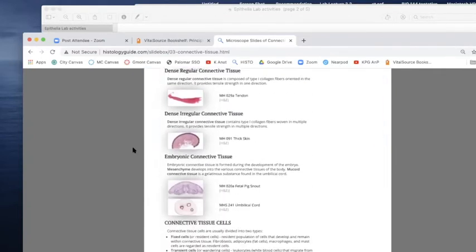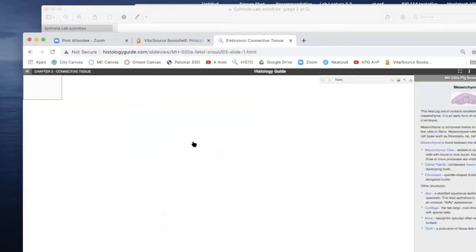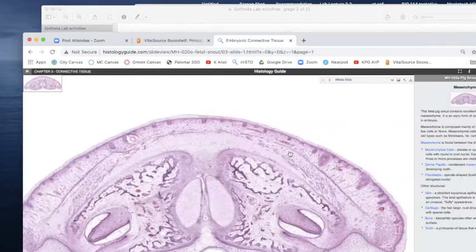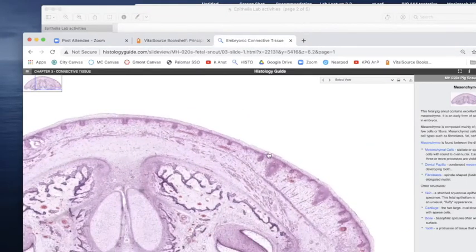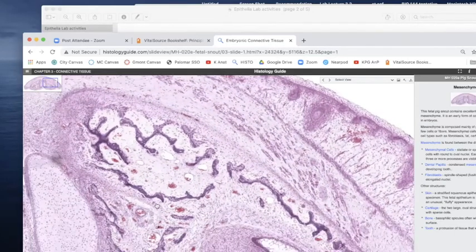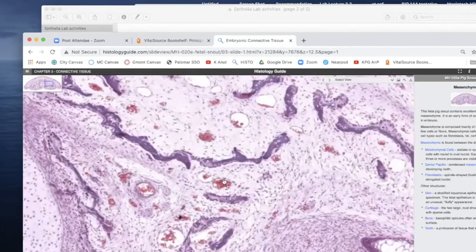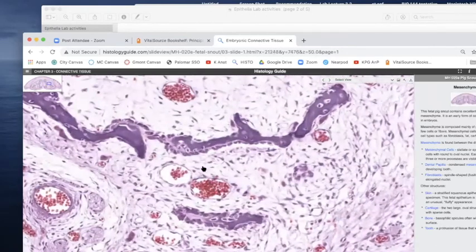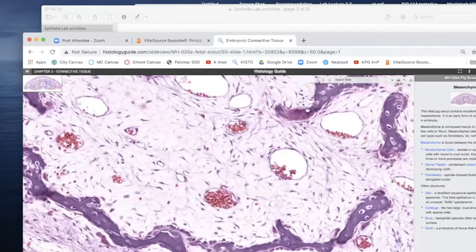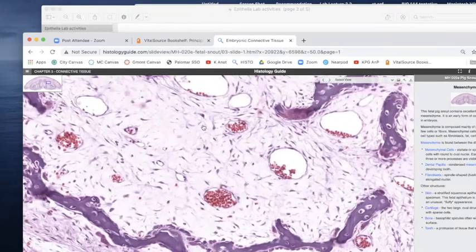And it is in this fetal pig snout. Remember, if I ask you what the tissue is, I'm not asking you if it's a fetal pig snout. I'm just asking you epithelial, connective tissue, whatever, right? So in this sample though, which does have a stratified squamous, because that'll be part of the skin, it's got bone, it's got cartilage, but what I'm interested in are all these blood vessels right here, because you could really kind of clearly make these out. They stand out a little better versus normal connective tissue.